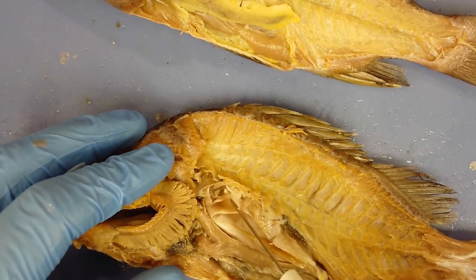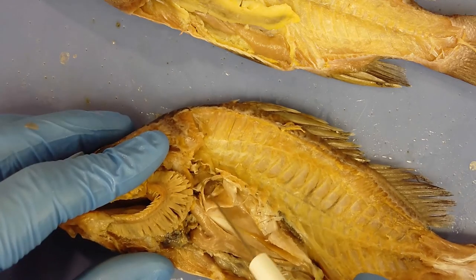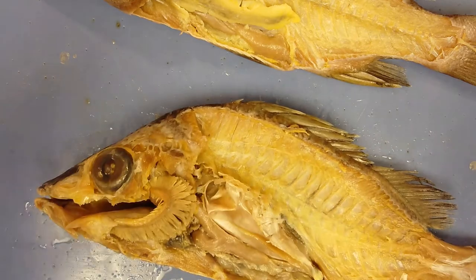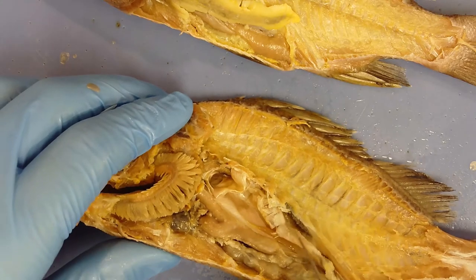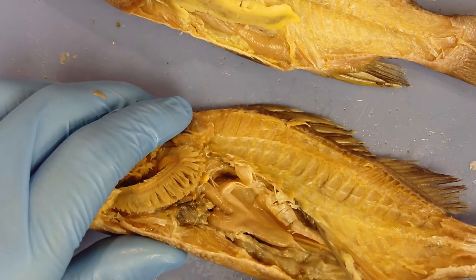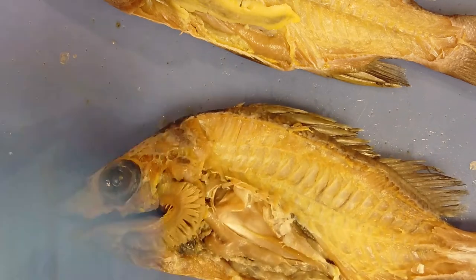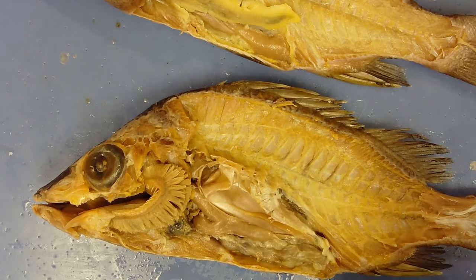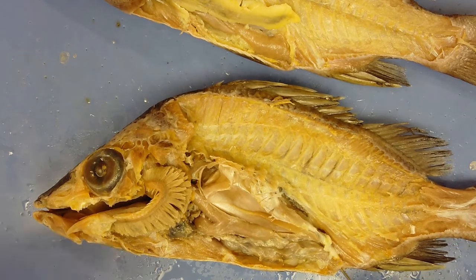The swim bladder has been opened to reveal another organ — the kidney. This collects metabolic waste and turns it into urine, which travels through the ureter to exit at the vent. The gonads, ureters, and intestine all meet and exit the body at the anus and vent.